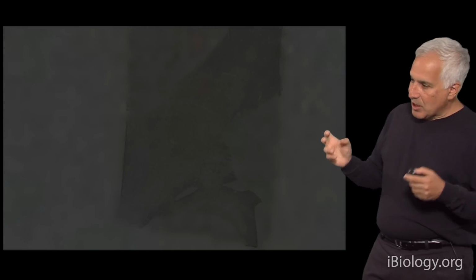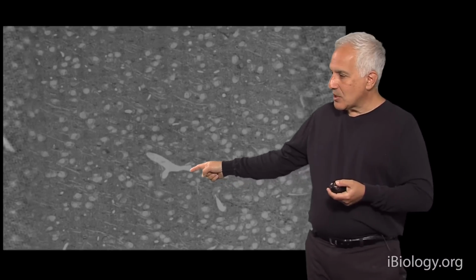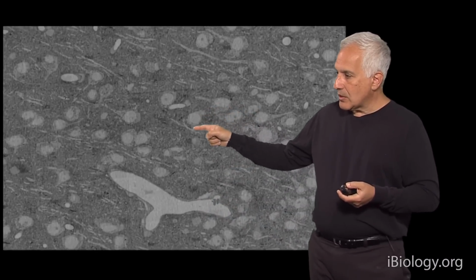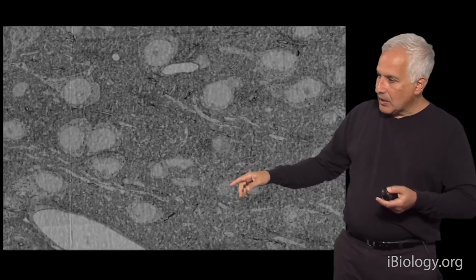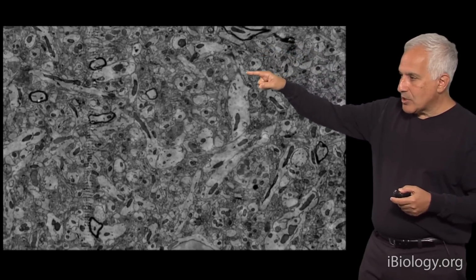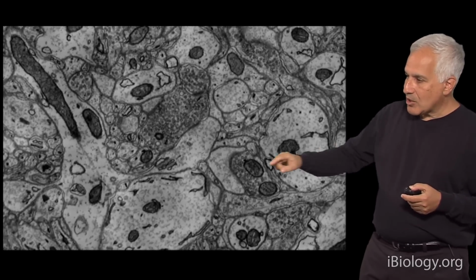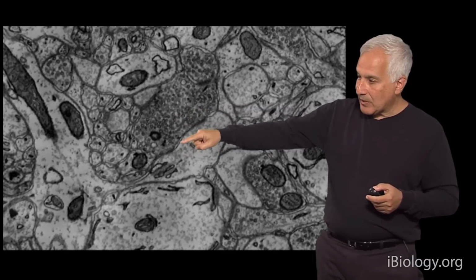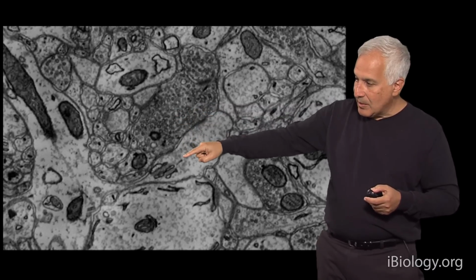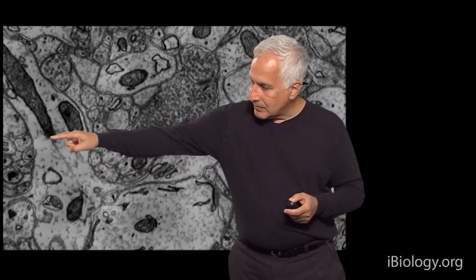So this is the cortex up here, and the hippocampus is down below. And at some point, he's got to enter the electron microscope. He obviously doesn't do that himself, but he puts the section in there. These are blood vessels, and these are the nerve cells. And these white streaks that you're seeing running diagonally, those are the apical dendrites. These black circled objects are the myelinated axons, and these dark objects inside cells are mitochondria, and here's a synapse on a dendritic spine, a vesicle-filled profile of an axon making a synapse on a spine with a spine apparatus that's attached to this dendrite over here.